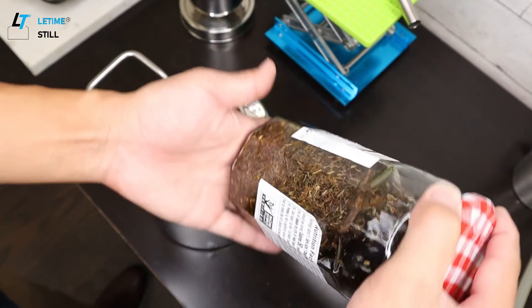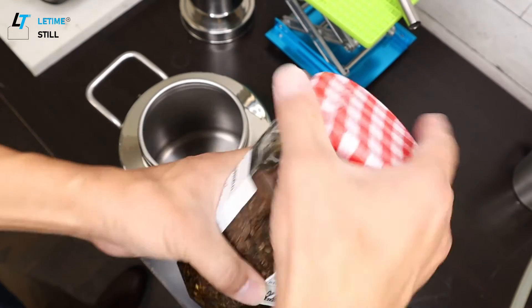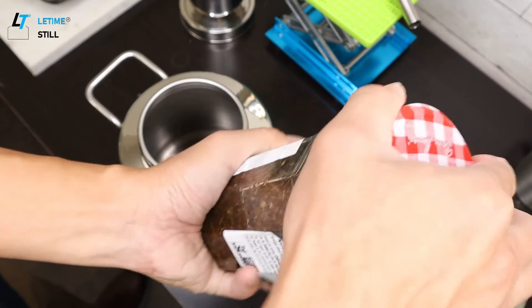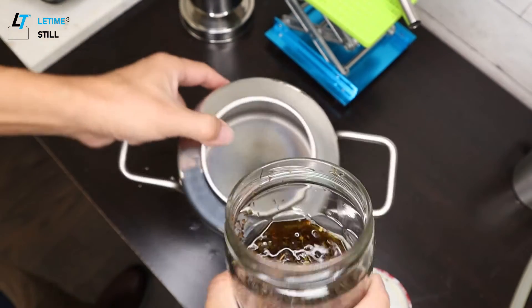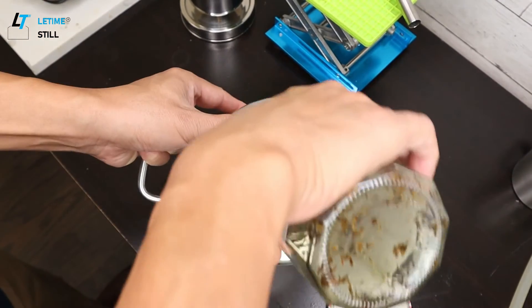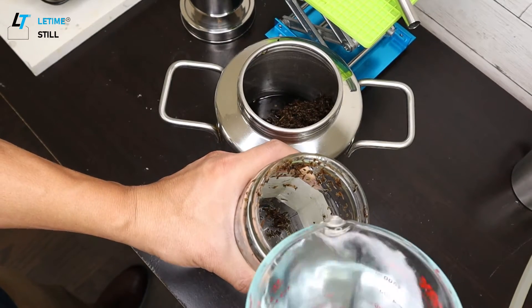For more detail about using the KD5 to make rose water, please watch my other video. This is a tincture I made last week. Normally a tincture takes at least two weeks, but for demonstration I'm going to use it. I'll add one liter of water.